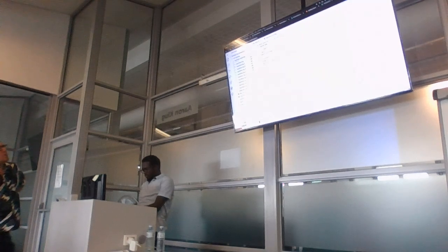But I don't understand your. I'm guessing that you've got a problem with your channel. Wait, no, that looks right to me. Yeah, it looks okay. I think it's a channel. But I look at the commands. That's it.